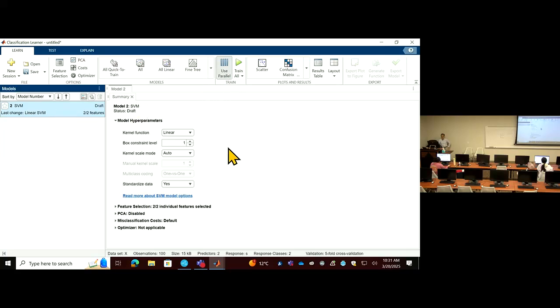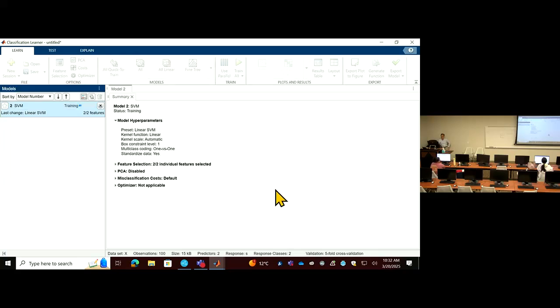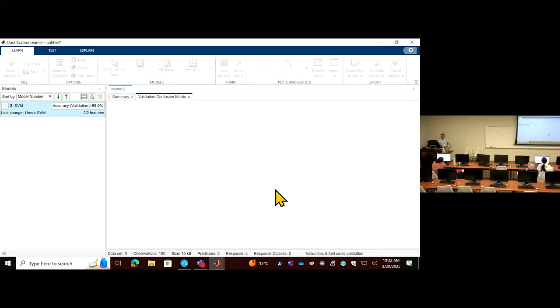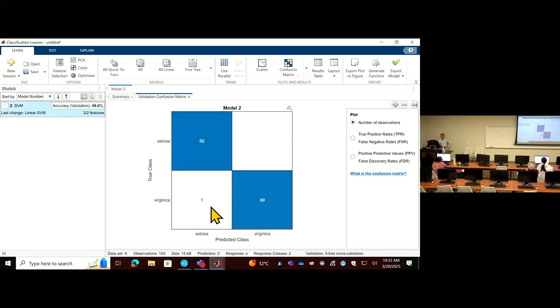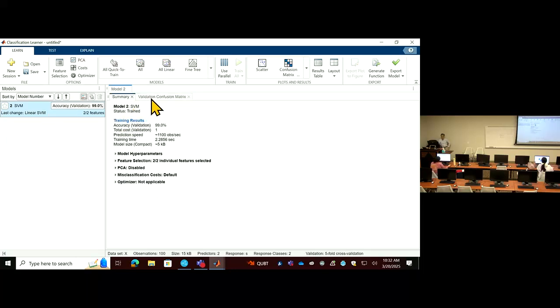So once you select your algorithm, you can do training, and I don't need parallel because there are so few points. Okay, it's done. There's one mistake. We know there's one mistake about this assignment. And that's a summary.